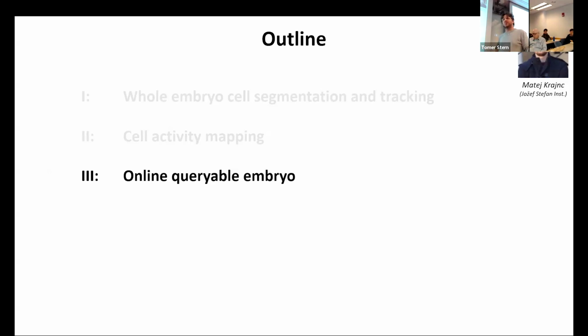Well, yeah, the simplest way is, you have mappings, right? You just look at the maps of this and that. So that's already something, right? The mapping of the activities that you saw before in the atlas. Just by looking at them, you'll see differences. These mappings are extremely sensitive. You will not find any mutation in which you will not clearly see the impact. But apart from that, of course, you can align the embryos here in point drift or whatever, and have quantitative comparison.